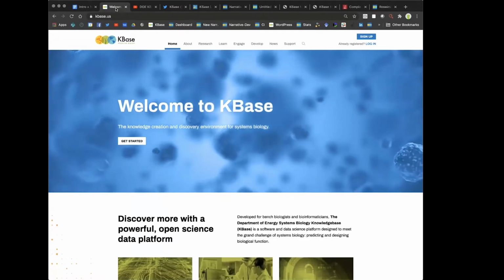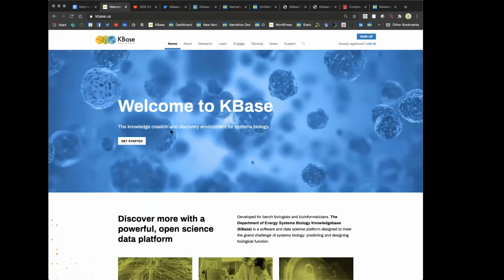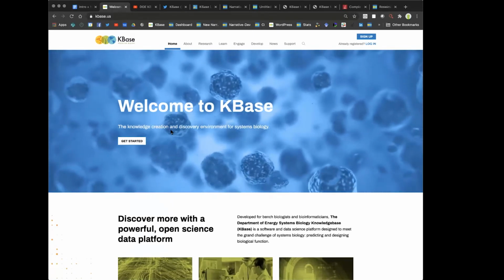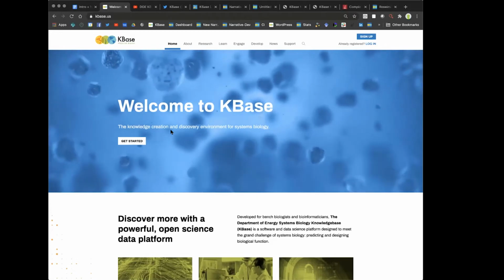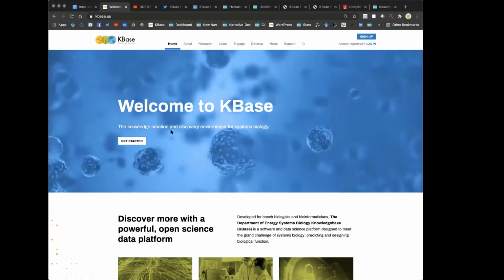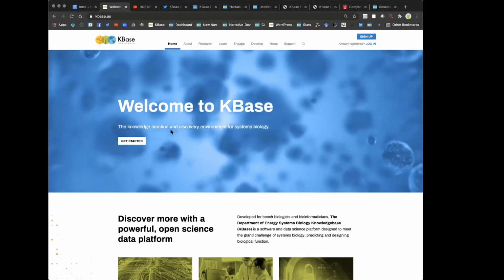All right, so I just want to start off with the kbase.us website. If you're going to KBase, you go through kbase.us. This is our brand new, basically redesigned homepage. We just launched this at the end of last year, so we're still building it out, but there's quite a lot of useful information here. I won't go through all of it, but just a few highlights.